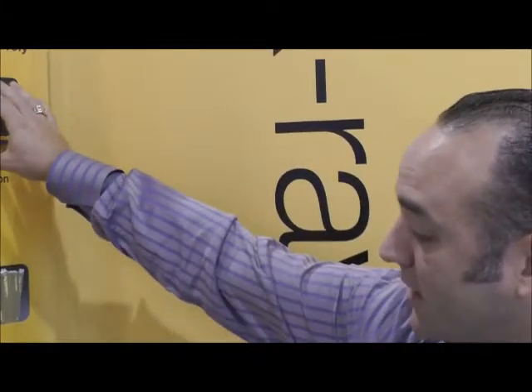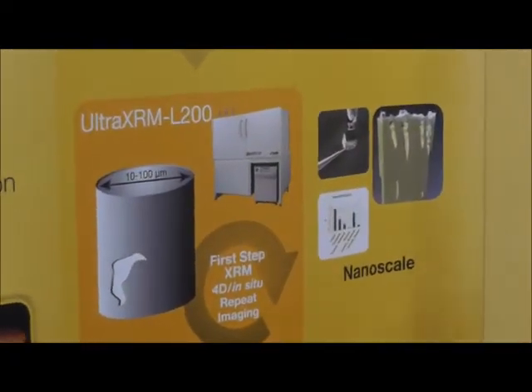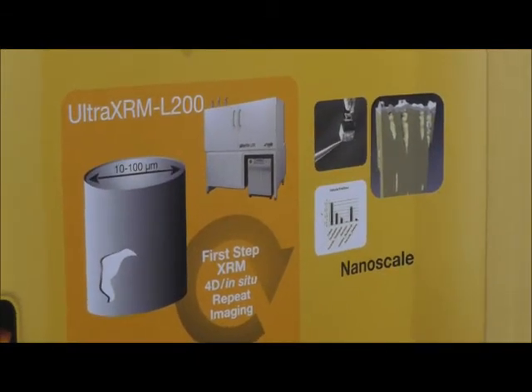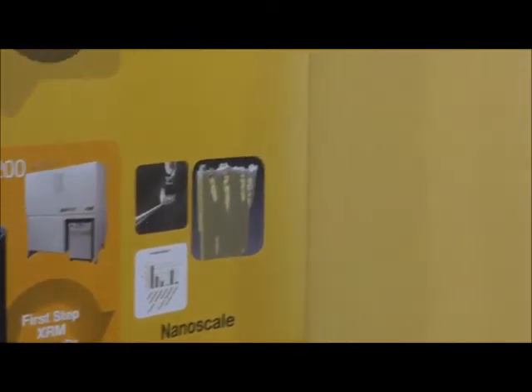In between this and the electron microscope lab fits the Ultra style. This is a synchrotron nanofocus style architecture. So here you're actually looking at monochromatic X-rays with Fresnel zone plate imaging objectives, and the ability to focus in and get very high magnification in the 50 nanometer or 100 nanometer resolution range.